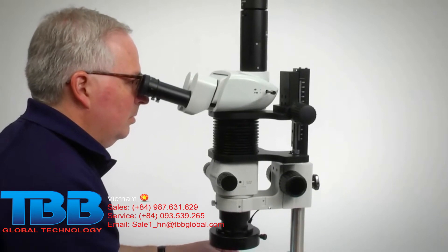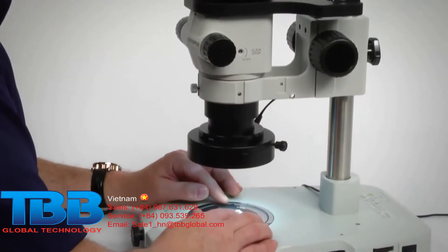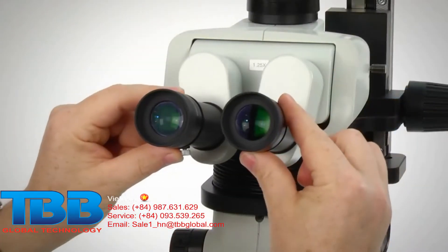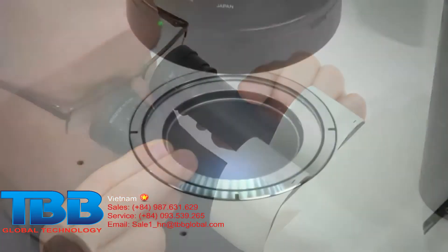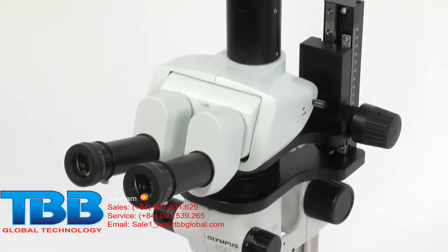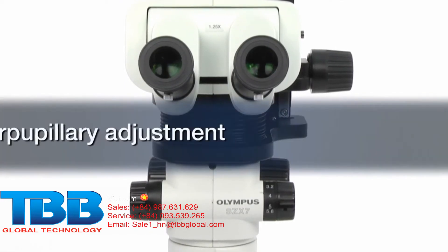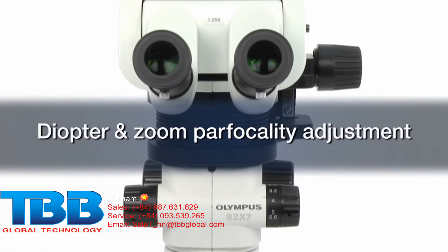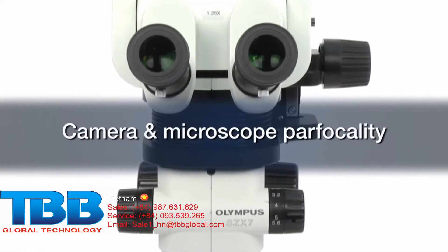Proper microscope setup is critical to help ensure optimal performance and safety when making observations or using a microscope camera. It also increases operator productivity and efficiency for a streamlined workflow. For stereo microscopes, three of the most important and often overlooked elements of microscope setup are interpupillary adjustment, diopter and zoom parfocality adjustment, and camera and microscope parfocality.